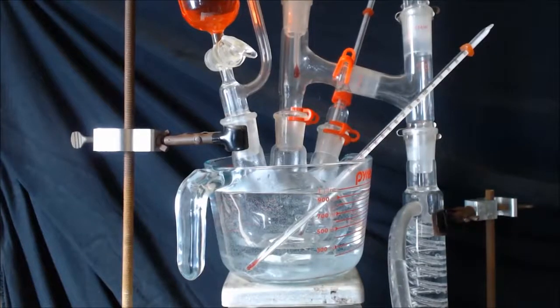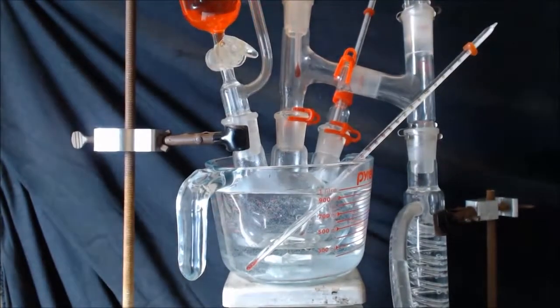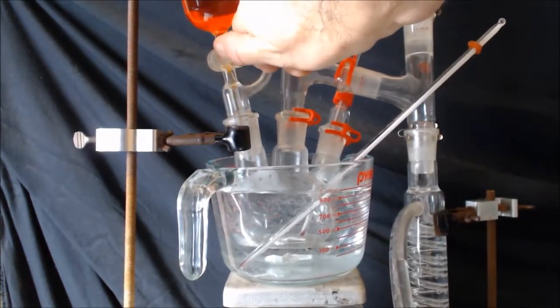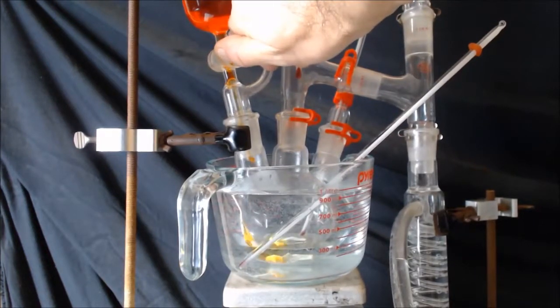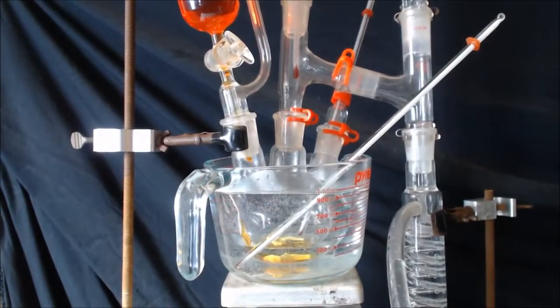Alright, I have the water at 50 degrees Celsius. Hopefully that's enough. I'm going to start dripping a little in. You can see it's starting to turn green a little bit.